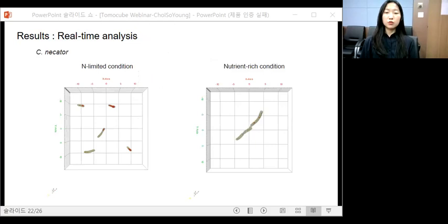Next, furthermore, we wanted to track a single cell to capture the whole process of PHA granule formation with cell growth. It might explain how the polarity difference between two strains occurred. Using Tomocube technology, we succeeded in making time-lapse movies showing the growth of cells and PHA granule for the first time.